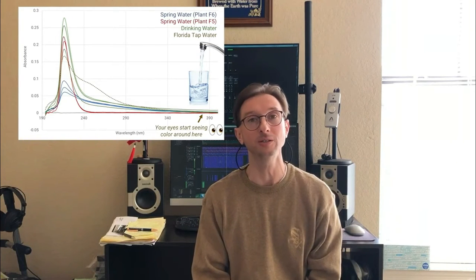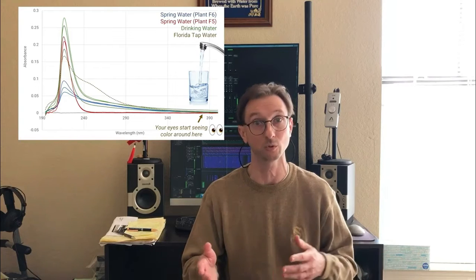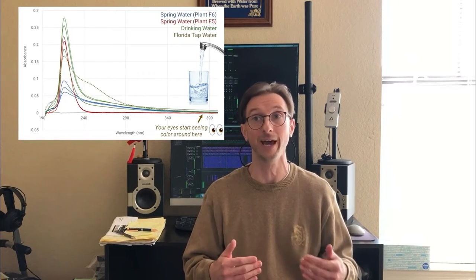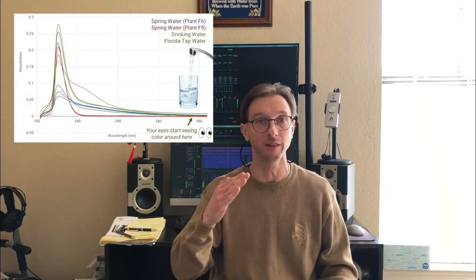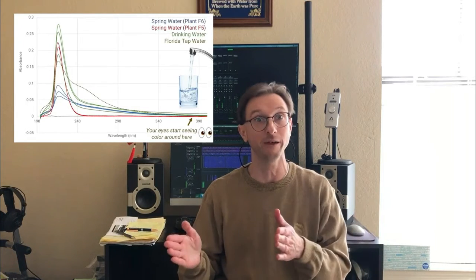And this isn't totally surprising. You would expect this from a number of influencers. One would be municipalities are going to add things like fluoride for your teeth to prevent tooth decay, which is good to not have your teeth fall out of your head. And also the pipes. Pipes aren't always new. Maybe you live in a new apartment, that's fine, but the water is still going miles and miles and miles through old pipes to get to you, and it's picking stuff up along the way. So that's what we're seeing there in that tap water, is in that increased absorbance at those higher wavelengths.